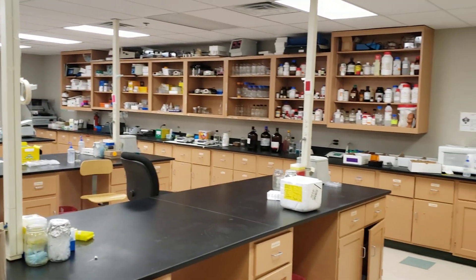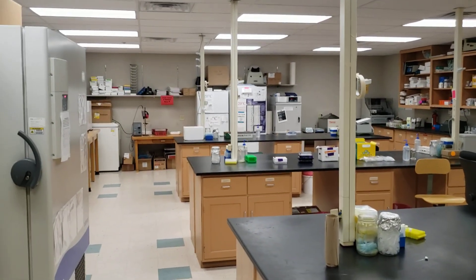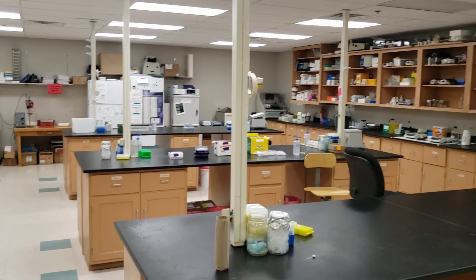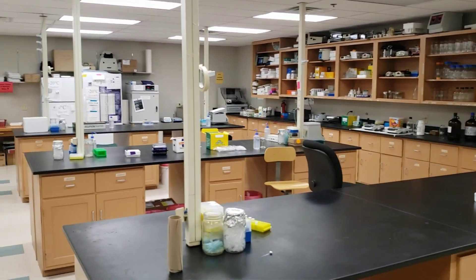I want to show everybody our teaching classroom — we call this our molecular biology teaching classroom. We teach genetics, phage biology, and sometimes cell biology classes in here. Now we've moved to our cancer research tissue culture classroom that we're starting to create.